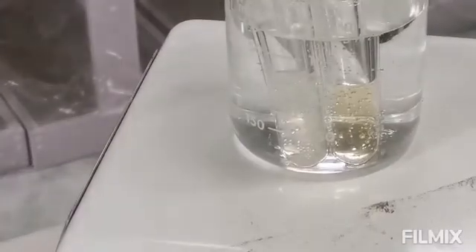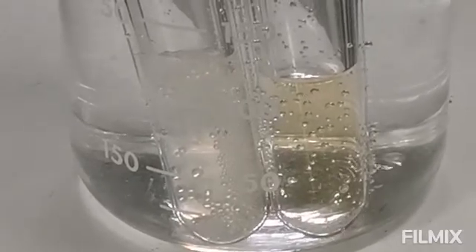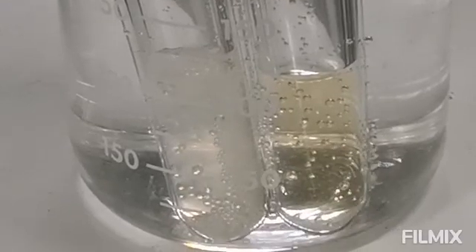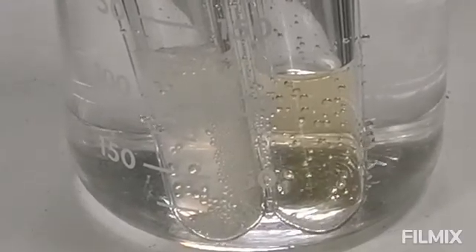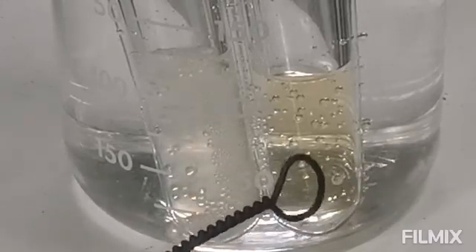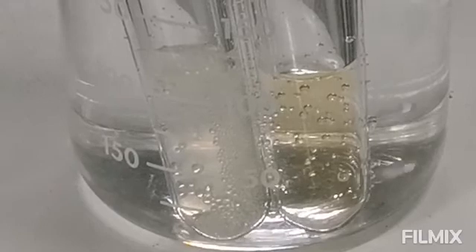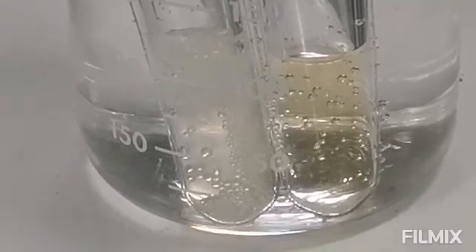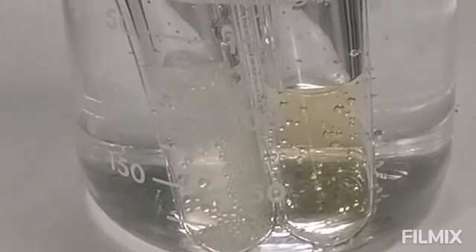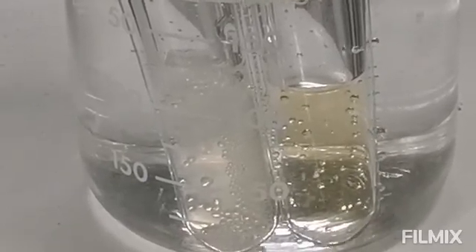A close up for your test tubes containing the albumin, this one, and containing the meat extract. So coagulation is happening in both test tubes actually. I have made mention of the word coagulation. When do you say that there is coagulation within a solution? The water is already in its simmering state.